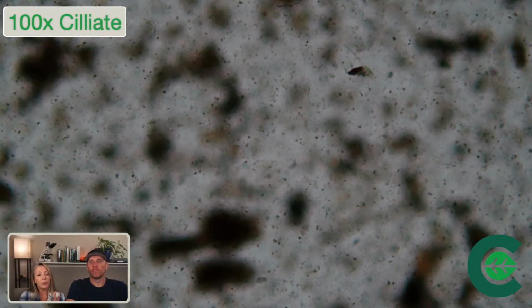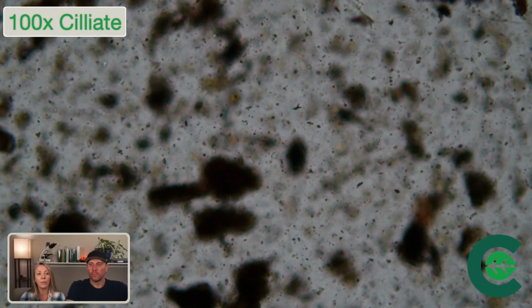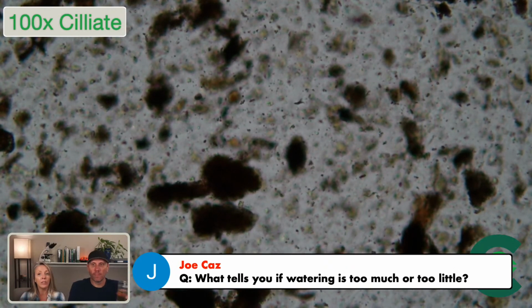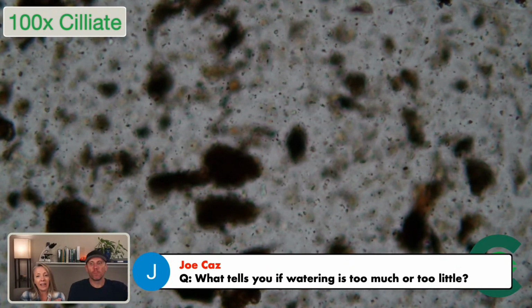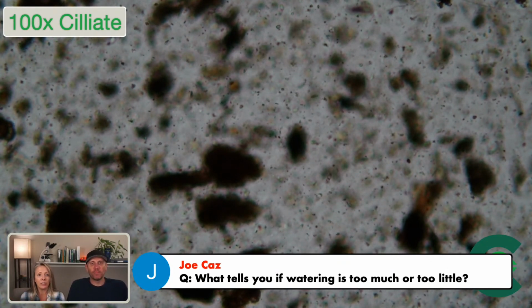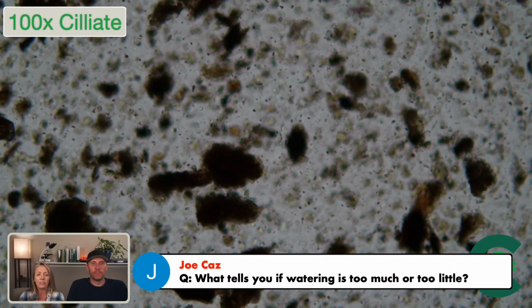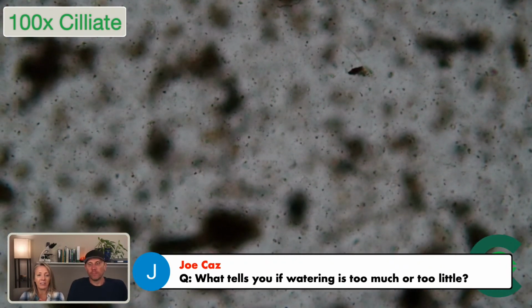Okay, so to orient ourselves to what we're looking at here, this is at 100x total magnification, which is your 10x objective. This level of magnification is not where you do your actual identification of organisms, but I wanted to show you that even at the scanning level, the level where we would be scanning for any nematodes, you can see this little guy moving around here. And what is he? He looks like a race car driver, right? Moving very fast, switching directions really quickly, just moving very, very fast in the soil.